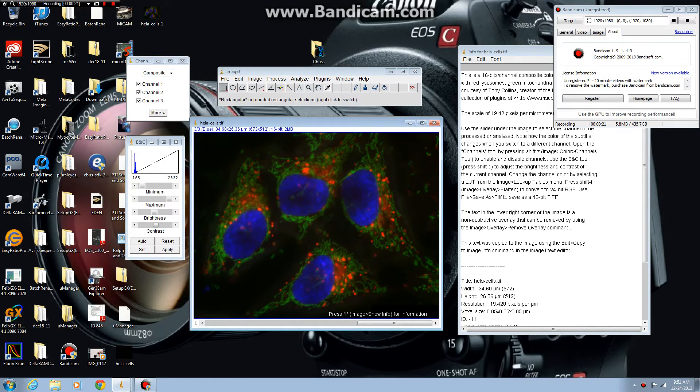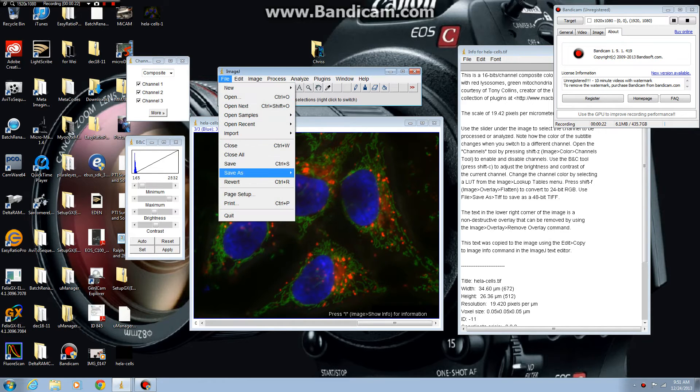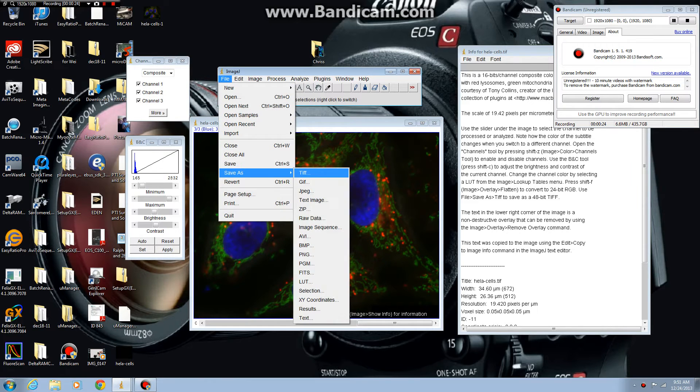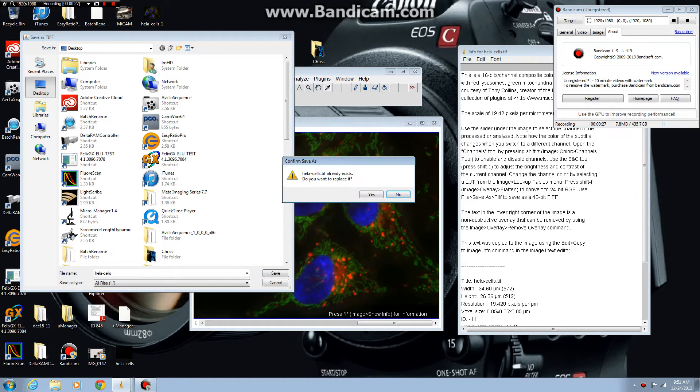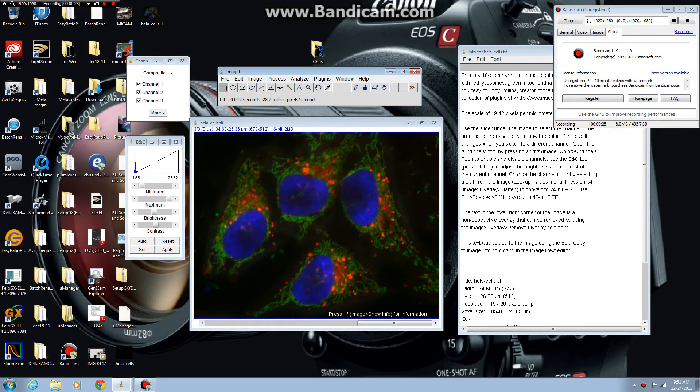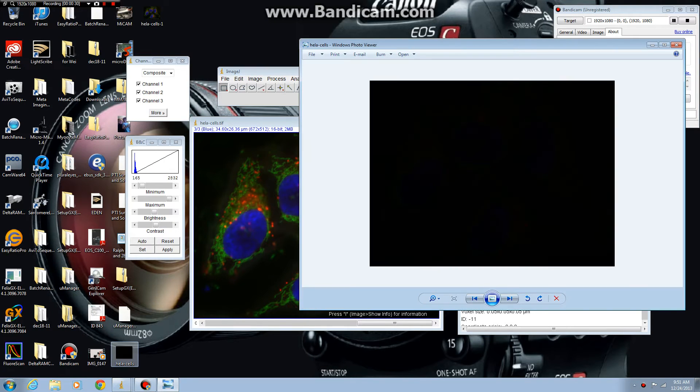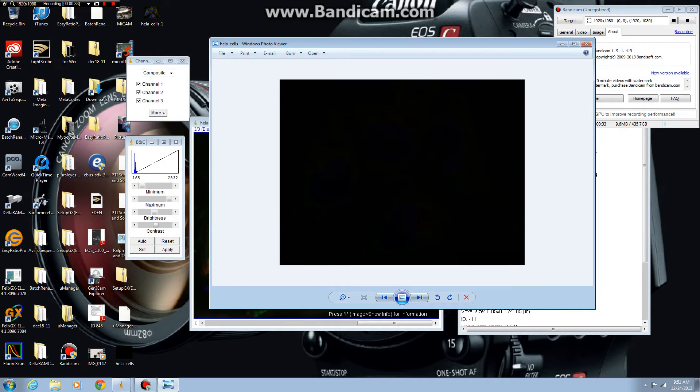However, if you save this image as a TIFF for instance to the desktop and you try to open it in another application, you can see that the image is black.